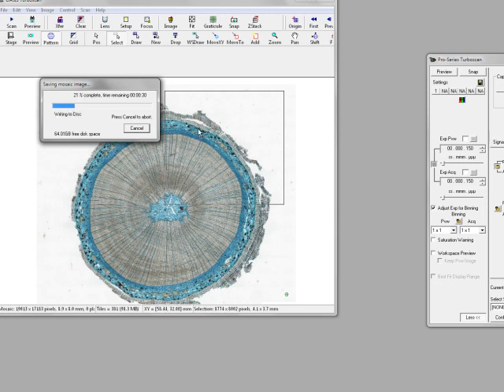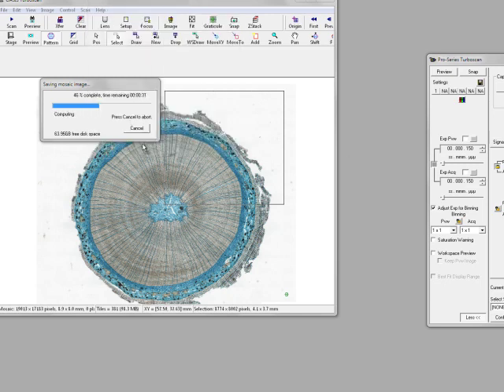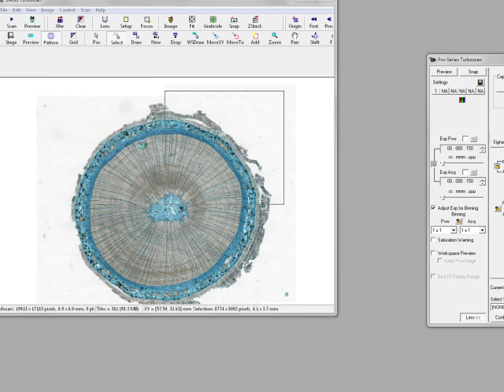Now, one of the things is I can actually do a lot more while we're using this. Inside ImagePro, we also have a series of macros that allow us to control this whole Turboscan area as well. So we have things that we can loop through files and do scanning and set areas, and each one of these can be added to a workflow for anyone to use to do their general imaging. Right, so let's just have a quick look. So now this image is going to pop up into the background.